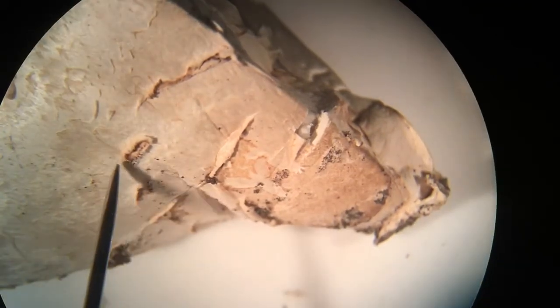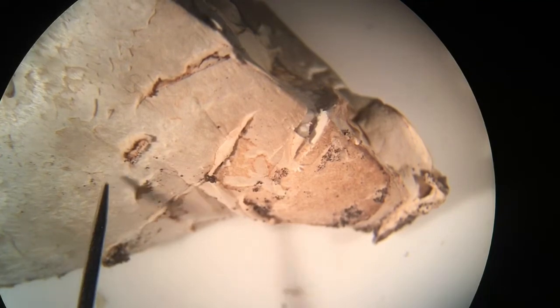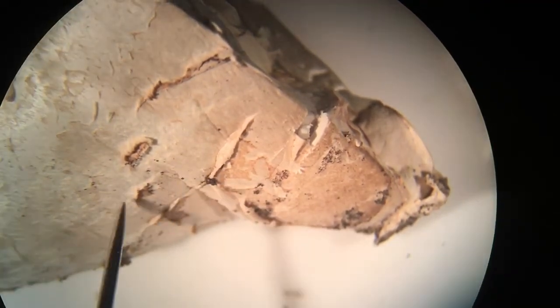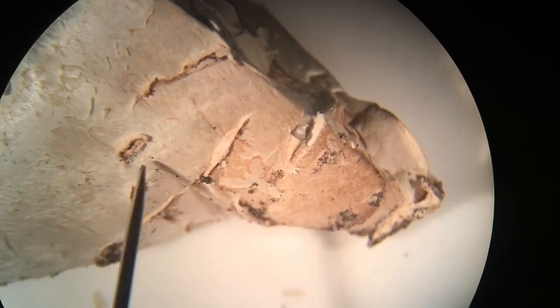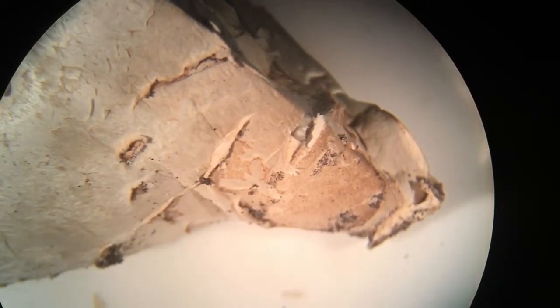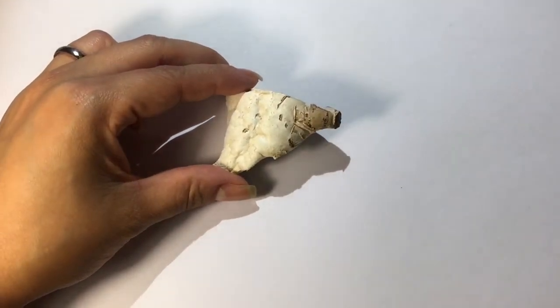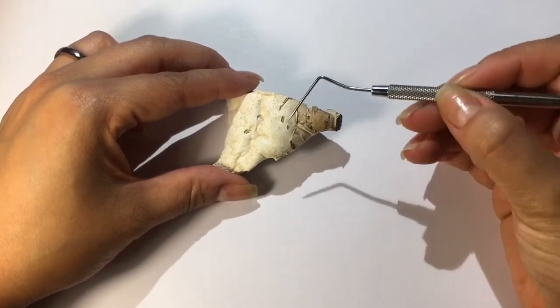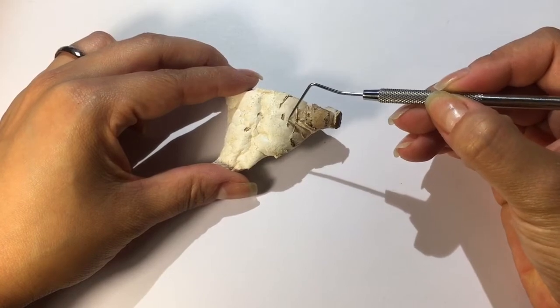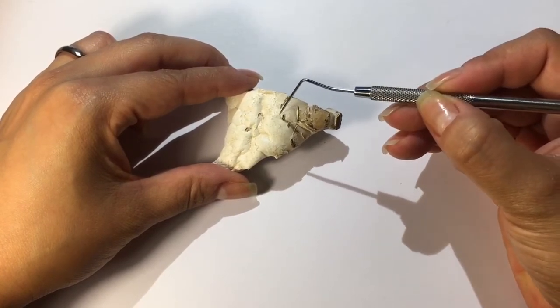Here, we can see there's clearly a patch that's different from the underlying surface. Again, this is Chlorophyllum, so this is not universal veil, but we're going to treat it as if this were a wart on Amanita. Okay, so here is our specimen, and the area that I'm interested in sectioning is this right here. So in Amanita, this would be a wart.